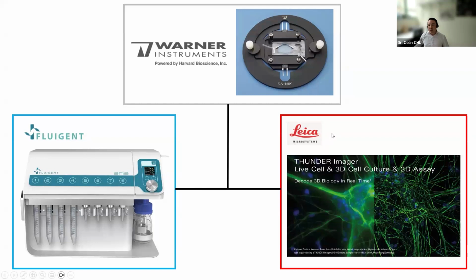So we were able to take our existing Leica, what we call a Thunder imager, which is a type of wide field microscope that can essentially deconvolve wide field images into near confocal like images. And the advantage of that is that it's also camera based, so you can take your images very quickly. So for example, an area of tissue that might take 1 or 2 hours to image on a confocal microscope could be done in the matter of 15 to 20 minutes on the Thunder.